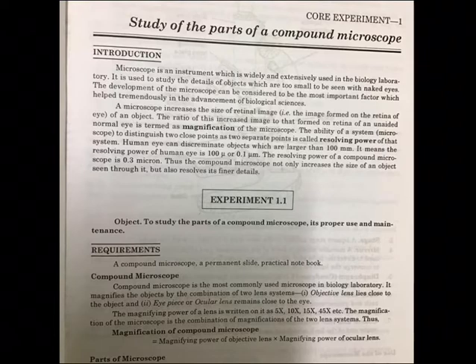Thus, the magnification of a compound microscope is the magnifying power of the objective lens, normally like 10x, times the magnifying power of the eyepiece. The eyepiece is also 10x, so 10 into 10, 100 times we can magnify it.